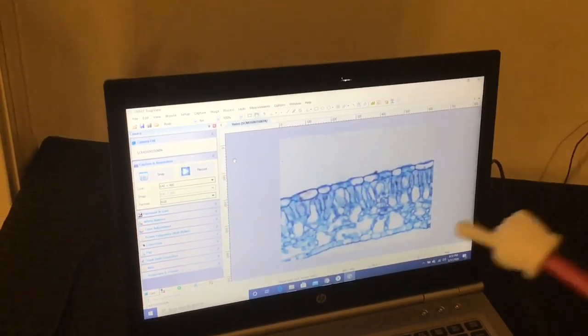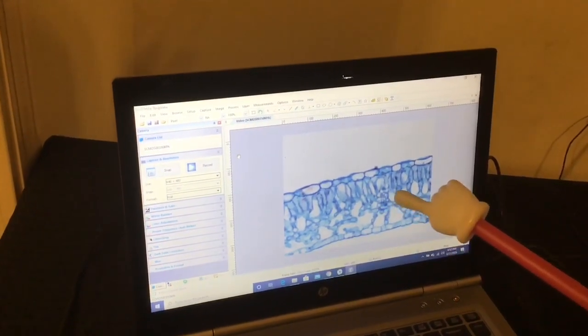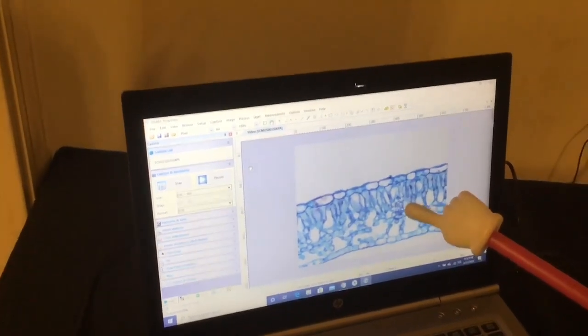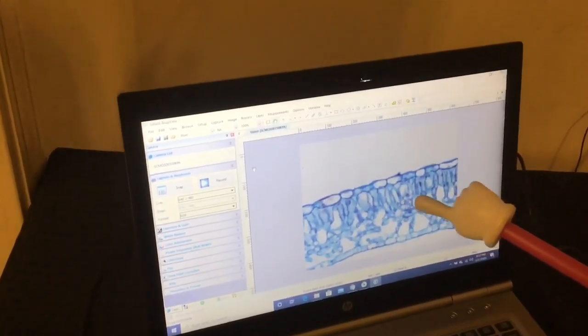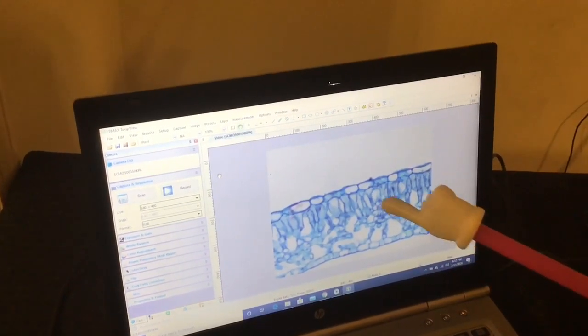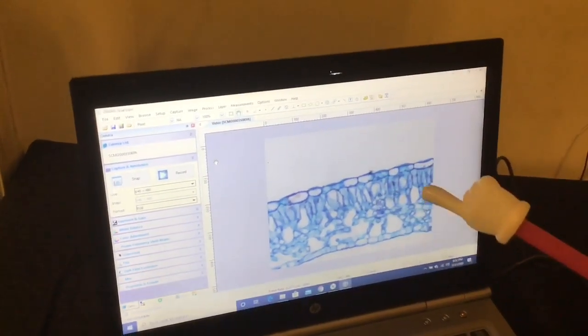And you can see here, this is your vein running through the leaf. It's gonna hold your vascular material. So you've got your xylem, your phloem, and your collenchyma are all inside these leaves running the length of the leaf to feed these photosynthetic cells and to bring the nutrients that they make back to the rest of the plant.